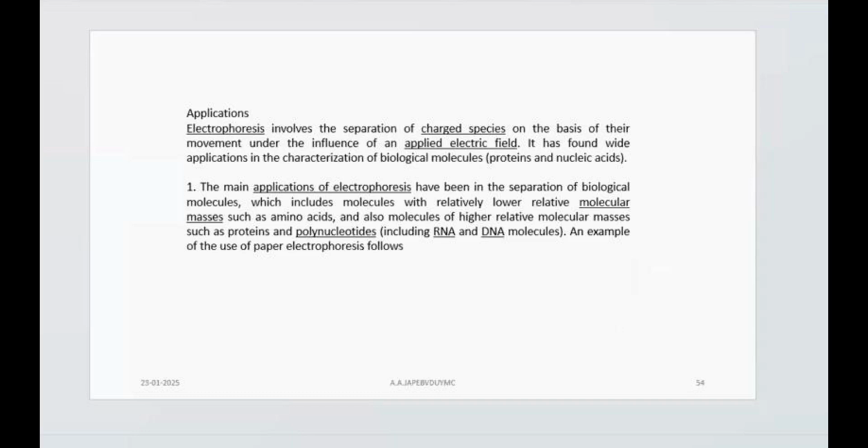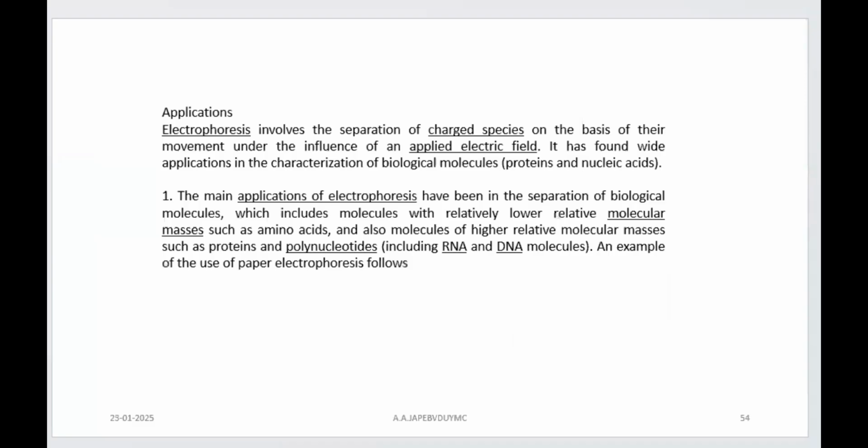So today we are talking about applications of electrophoresis. We have talked about gel electrophoresis, agarose gel, as well as polyacrylamide gel also. When we talk about electrophoresis, the very first purpose when it comes to applications is what? To separate charged particles, charged molecules, charged species, right?